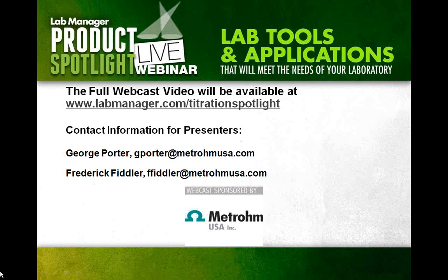Additionally, there are some other big factors that influence your titrations. We covered a lot of it: the condition of your sensor, the reagent, basically if it's been standardized recently or if it's aged and it may have changed concentration. We're doing a controlled chemical reaction, so there are a lot of different influences, including things like stirring speed and even the direction you're stirring your titration. So if you do it clockwise or counterclockwise, depending where your sensor is and your titrant dispensing, it can actually greatly affect your titration if it's not set up properly. Got it.